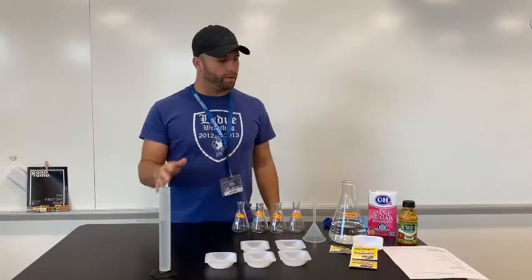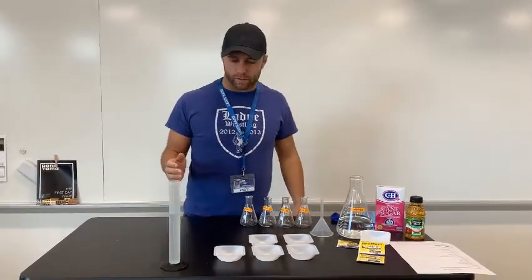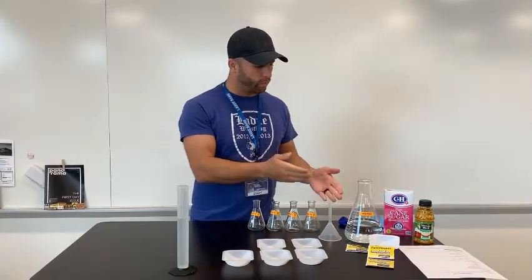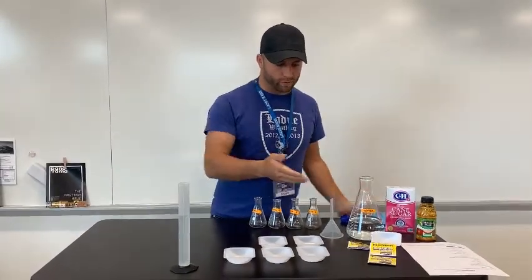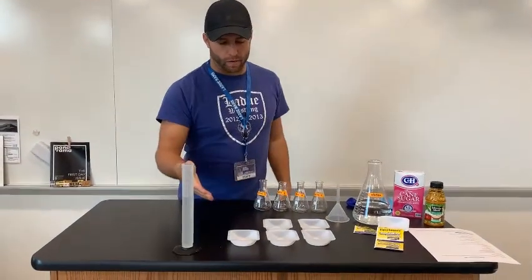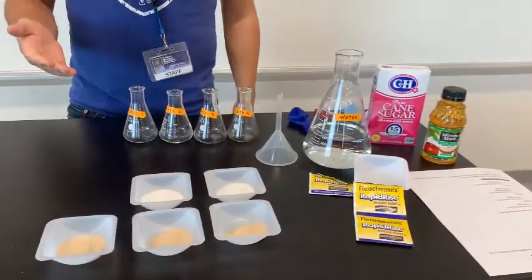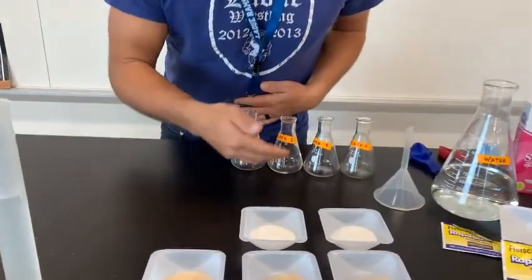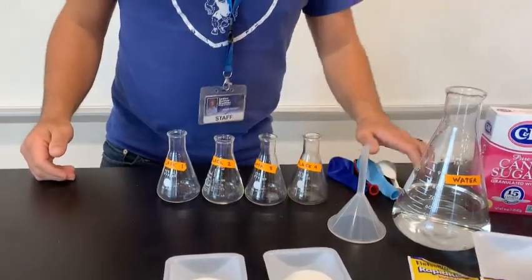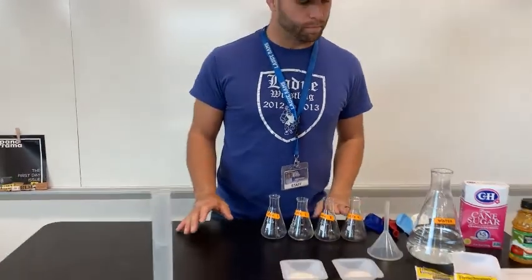Hey everybody, welcome to the fermentation lab. Today, as you can look and see, all my supplies are here. I have everything that I need — pretty much everything measured. We have water, sugar, apple juice, some instant yeast measured out in one gram portions, some sugars measured out in 6.5 gram portions, and four flasks — one, two, three, and four — as shown, as well as our four balloons which we will put on our flasks in just a little bit.